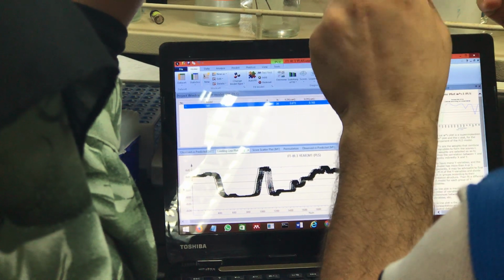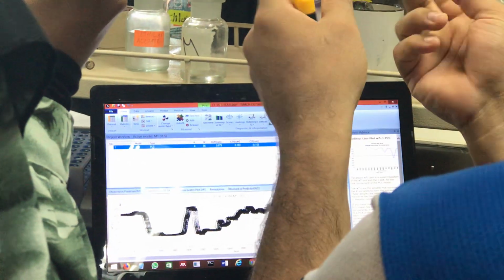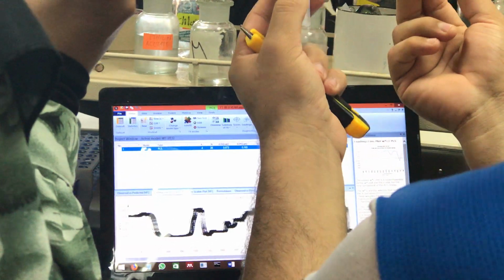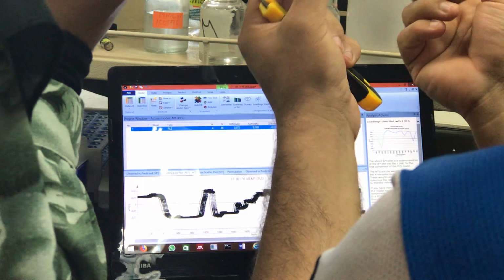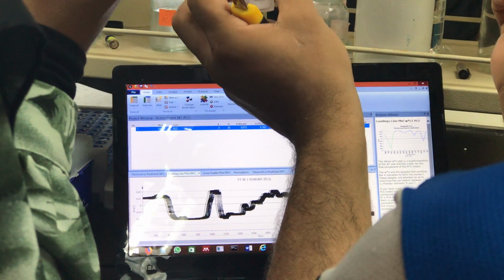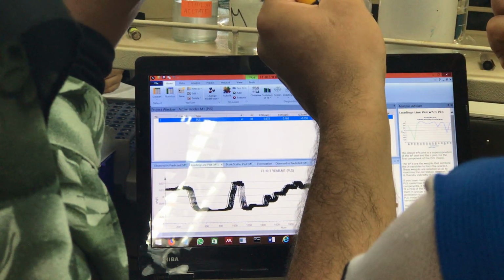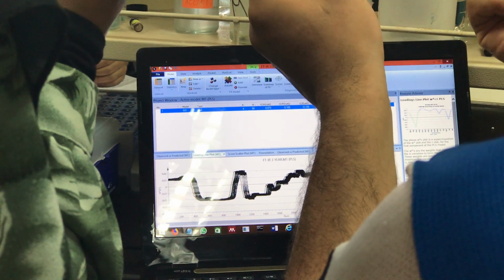Because there are 2 ways. The first way, you help the software: supervised methods. I tell it to tell me the difference between the colors. Or unsupervised methods, I ask in general for the difference between these 2 pens.